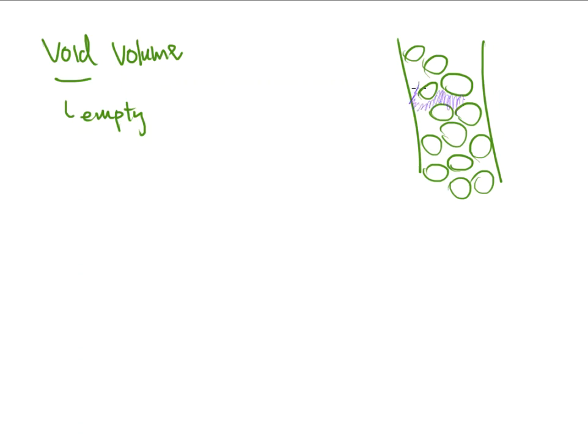So all of this purple area that I'm coloring in is a lot of dead space, right? This is area where a particle is not going to be located. It's an area that I have really no control of sometimes. And depending on the particle and how the particle has been packed inside of that column, this can change how much of that empty space is present.